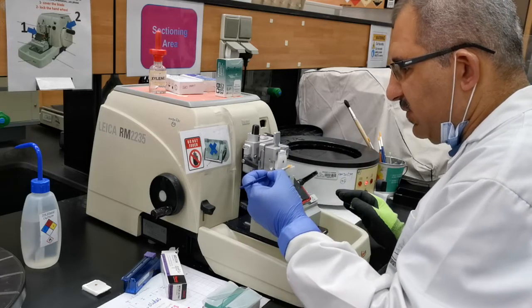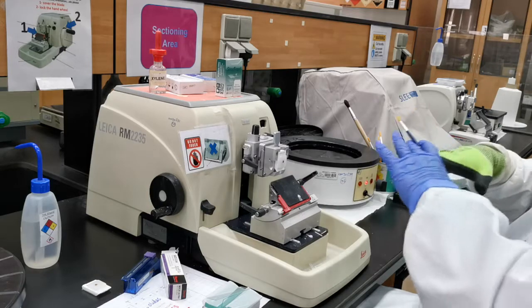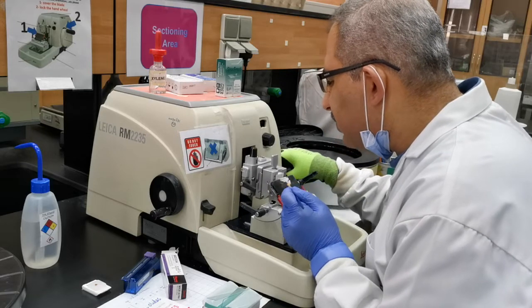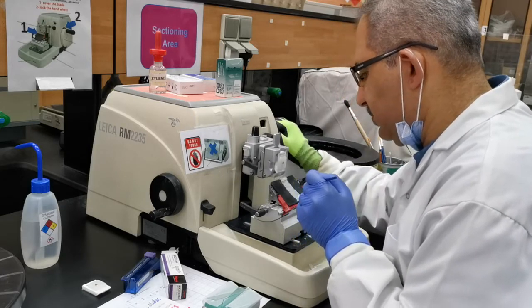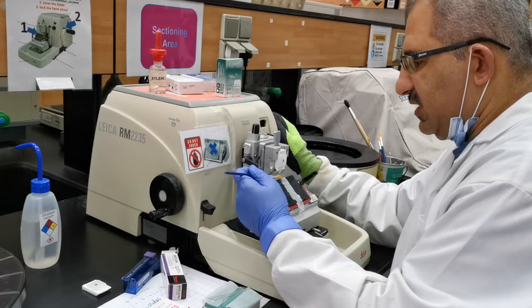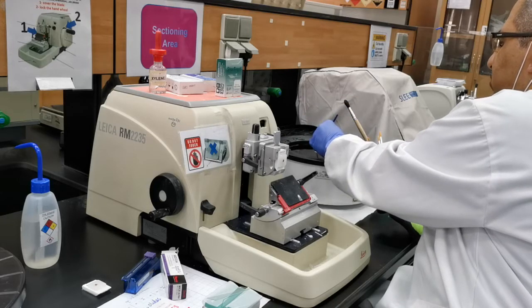I'm happy with these sections and I want to collect them. Don't use metal next to the knife edge. What I do is transfer them with the edge of a brush — it's all about skill you need to build up. Just at the edge where the section is attached to the knife, I take it off; it's very light, and then just onto the surface of the water bath, where it will spread with the temperature.